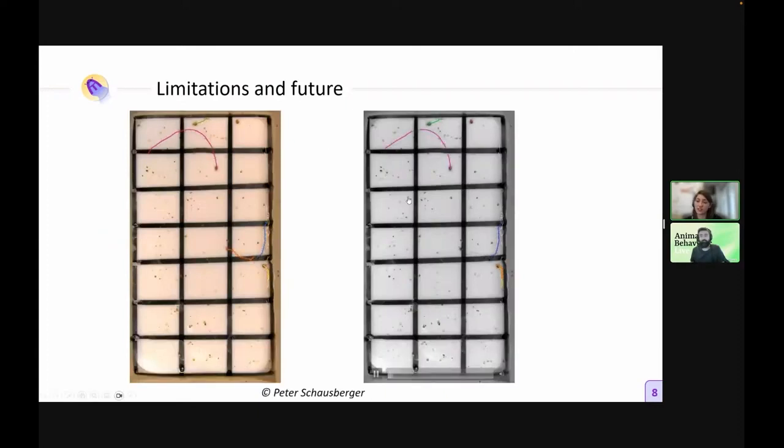It's exactly the same functioning as the background, except that instead of comparing just the value, so in the case of the background you compare the two grays, here you compare the three colors. The only difference is that in that case, of course you can solve this kind of problem, but it's a bit slower to process because the program has a bit more color to calculate, but it's a very small difference.